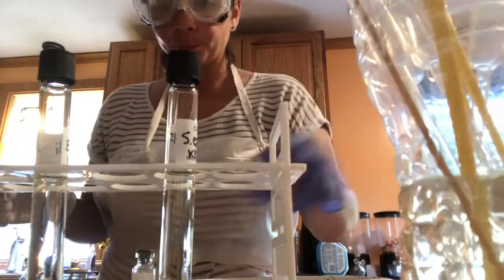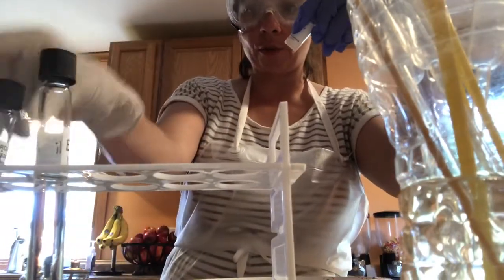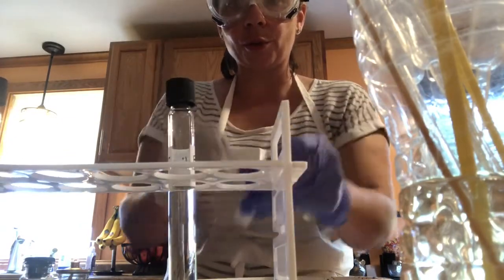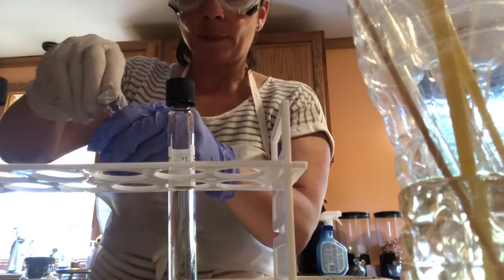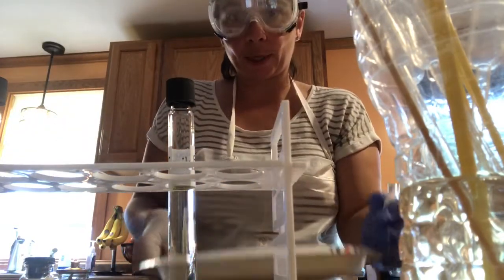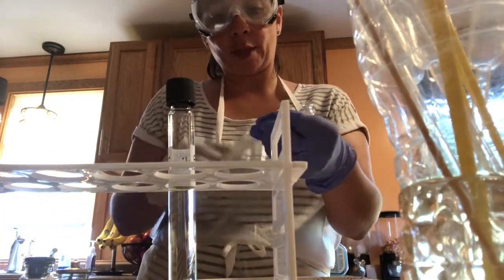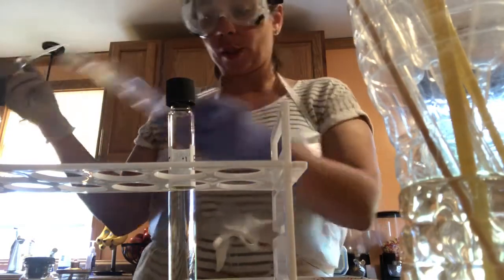Okay? So I have my E. coli, the thinner of the two tubes that are left. I have the broth tube that it's going into. This lid is already a little loose to make it easier. Okay, I'm gonna open this up by the stopper. I'm gonna put it outward side down on the plate here. Okay, like that. You can see. I'm gonna open up one of my transfer pipettes by the bulb end, right? Never ever by the end that's gonna go into the culture.